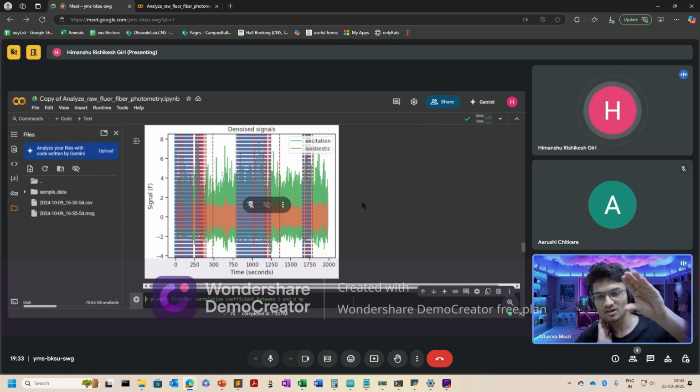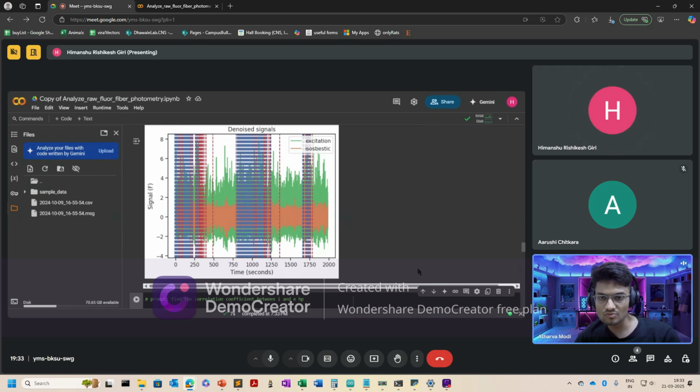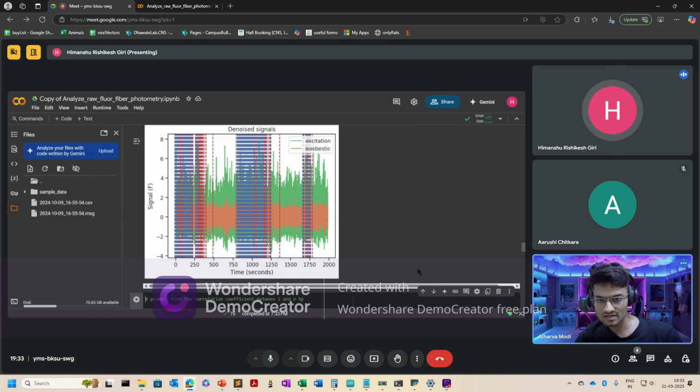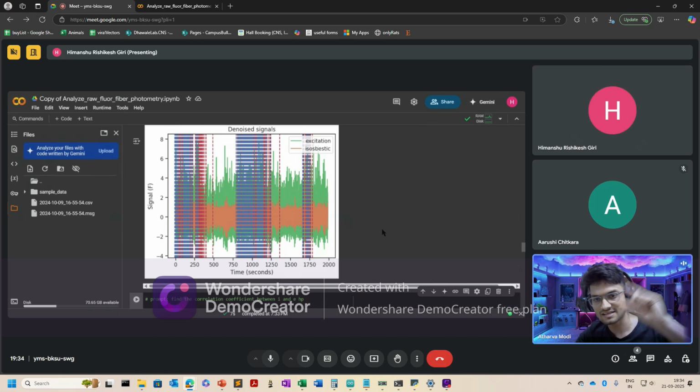So the dopamine activity is reduced when it is resting or not doing any movement. When it is not doing a task, it is either grooming or eating, then dopamine will come. But when it is not doing anything at all, then it will be shallower. Those kinds of things are also clear from this, but not the tonic level. You can't get wave-like things or what percentage of change. You can only measure average level from phasic changes.